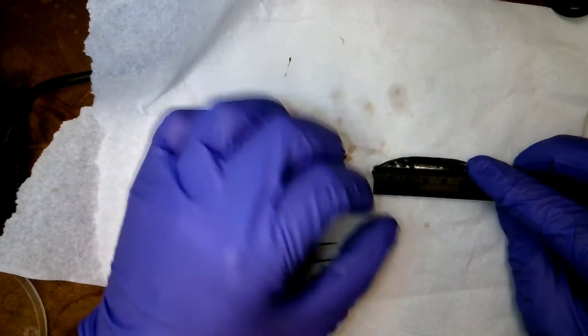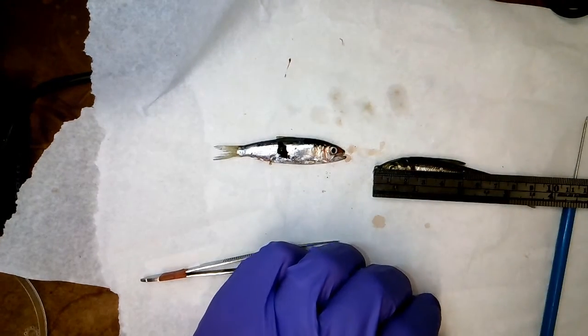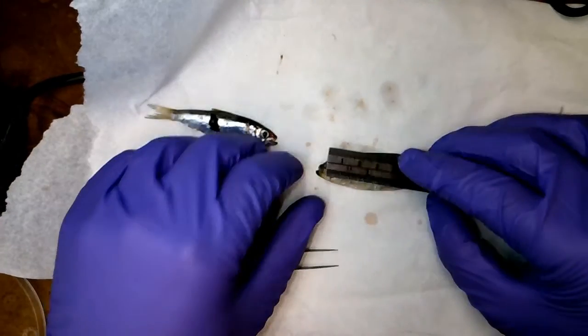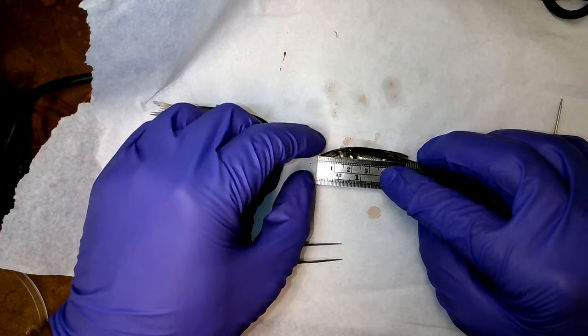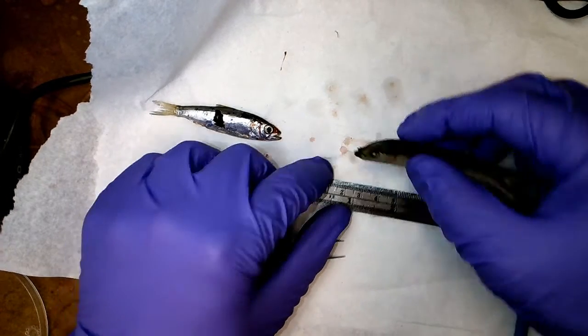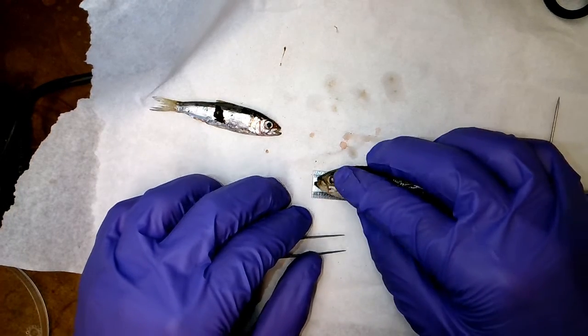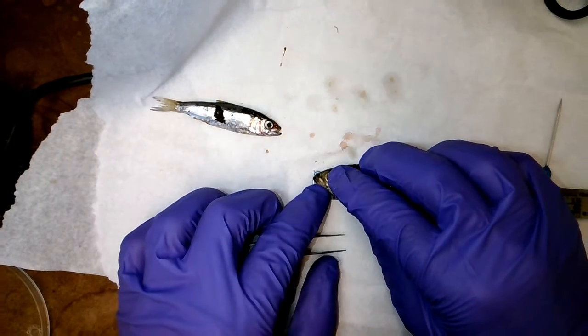Okay, so when you're making this measurement, I want to make sure you're at the snout. And I like to put the fish on top as one way to overcome battling the curvature of the fish.